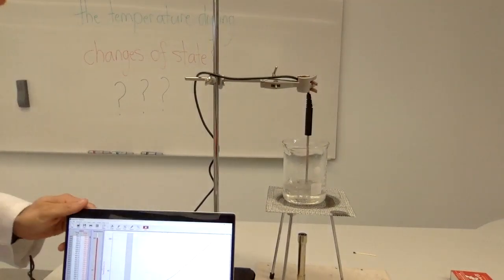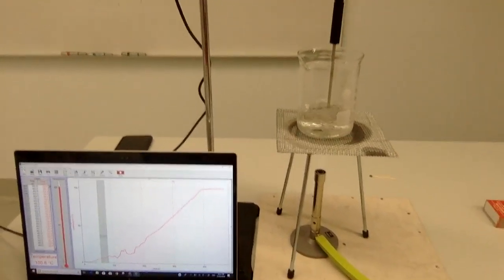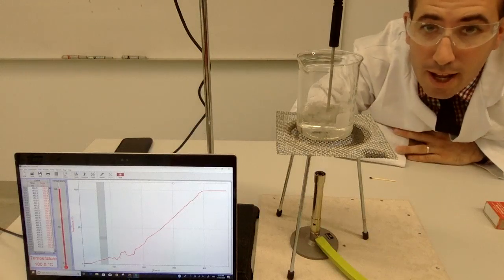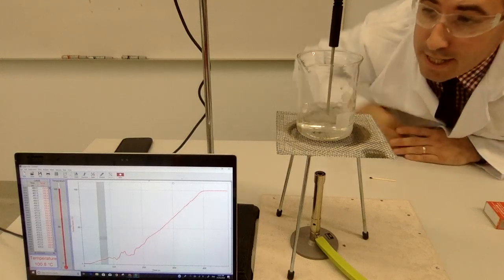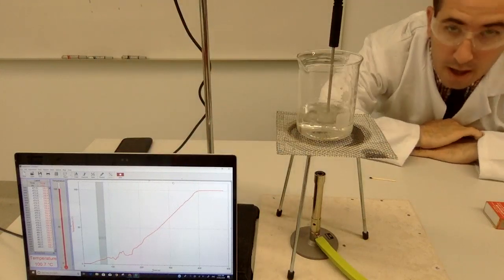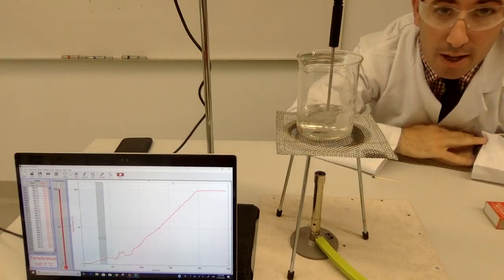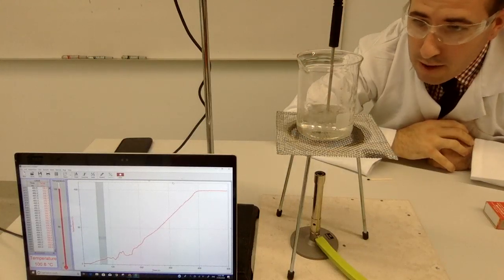So is this an accurate experiment? I would say yes. Accurate, why? Because it matches up our value we have here of 100 degrees to our known boiling point of water. And it's continuing to go, continuing to go. And what you'll see is that the temperature is not changing. It's flatlining. So that means that the temperature of the water is not getting any hotter. It is exactly the same temperature. We've been boiling for about a minute or so now, but it's not getting any hotter.